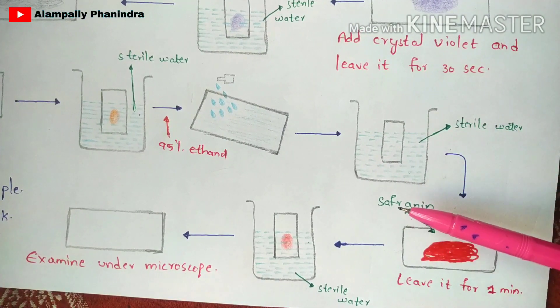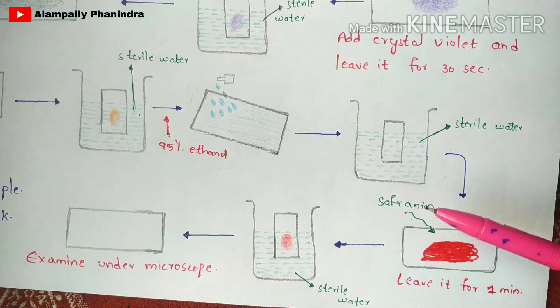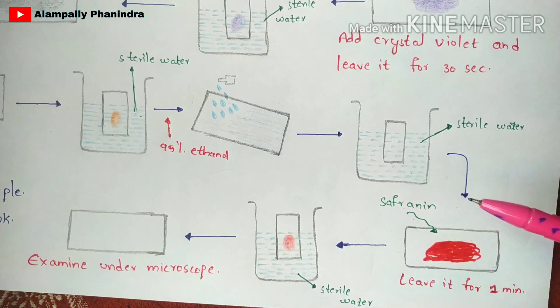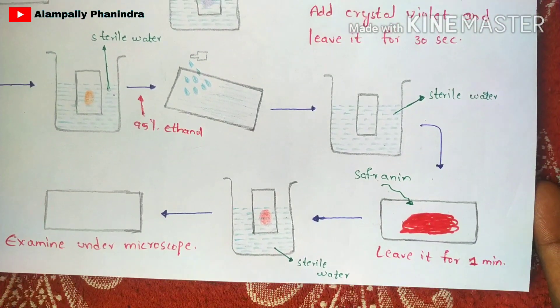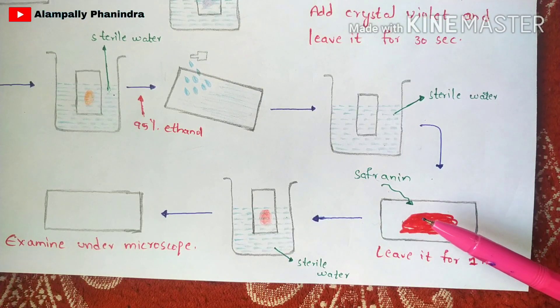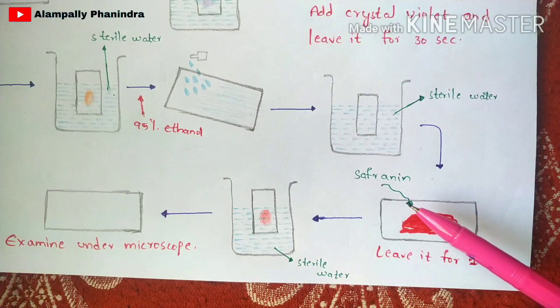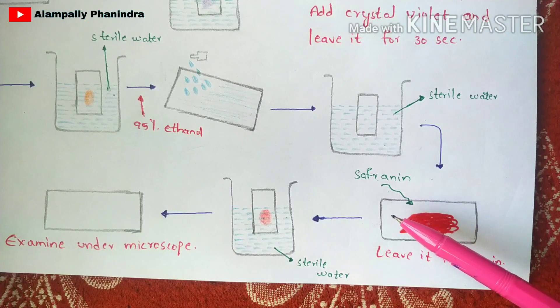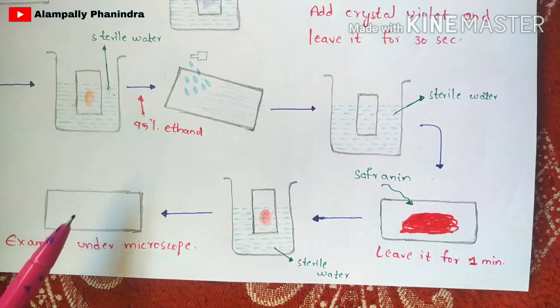On the cleaned slide, add safranin — note that the bacterial colony is still present and will not be removed. After adding safranin, leave it for one minute. After one minute, take a water bath with sterile water, dip the slide containing the bacterial colony treated with safranin, wash the slide again, then remove it. The slide is now ready to be examined under a microscope.